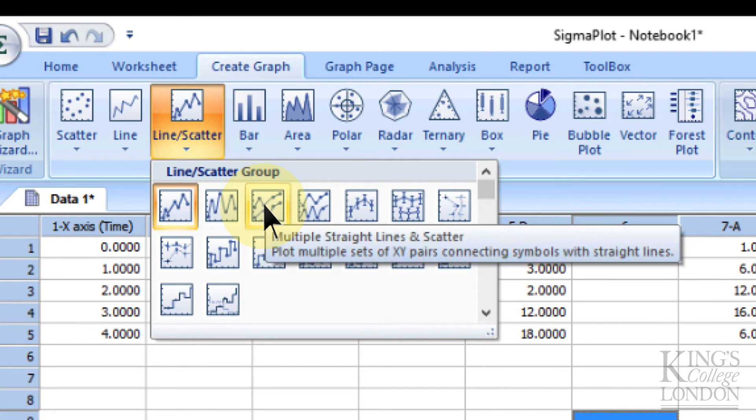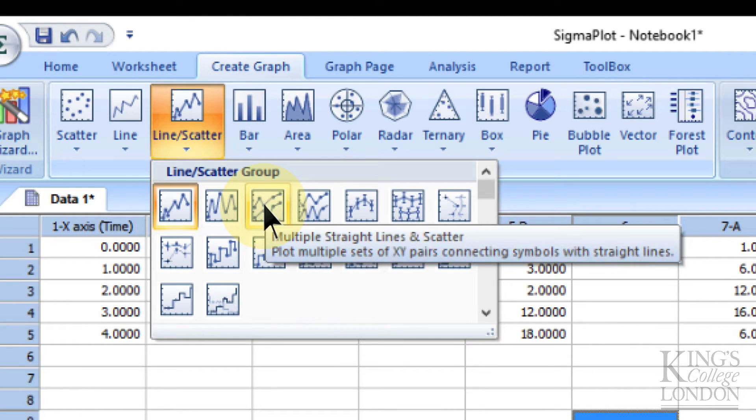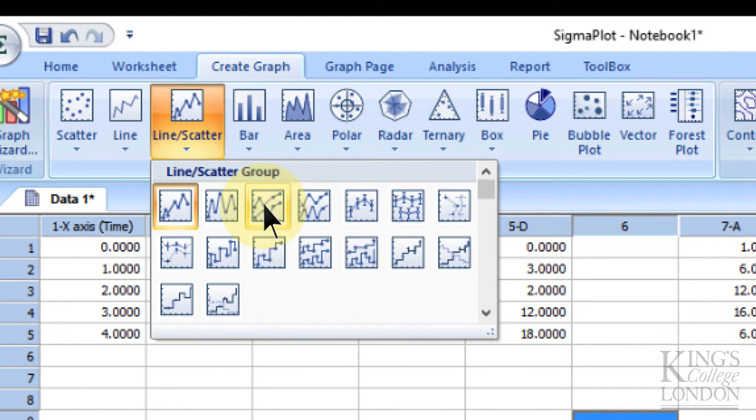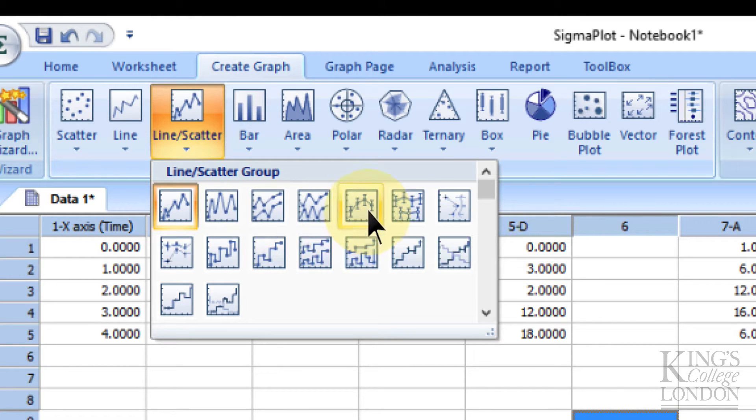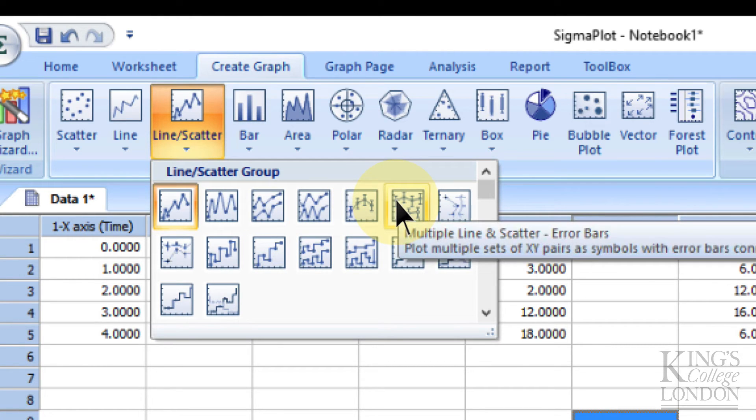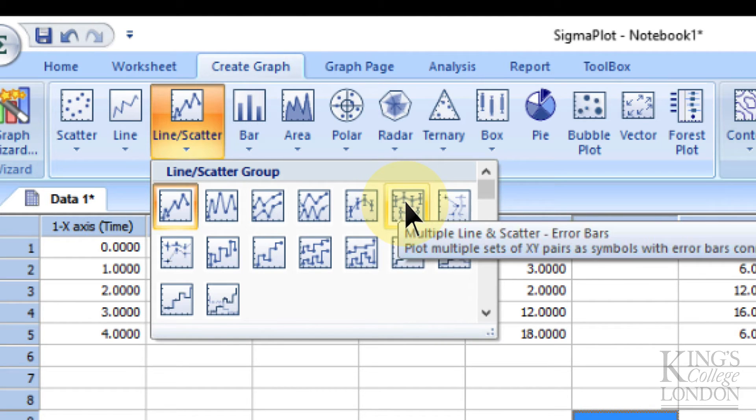The third one is a multiple straight line with scatter, but there are no error bars. We want to show some variance, so we want to show, for instance, standard deviation. So in the case of this one, it's the sixth one along here, multiple line and scatter with error bars. So we click on this.